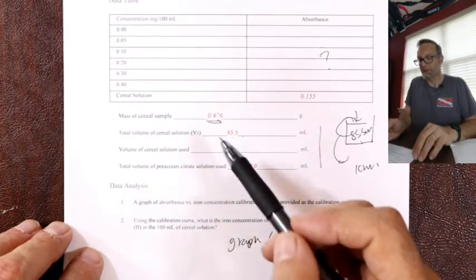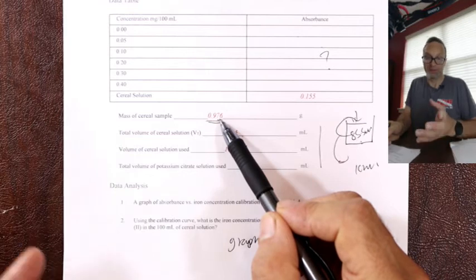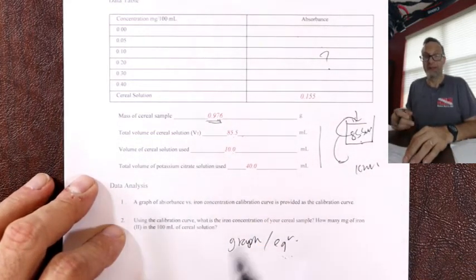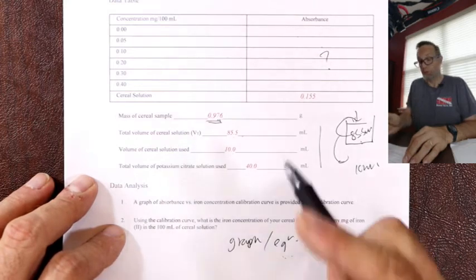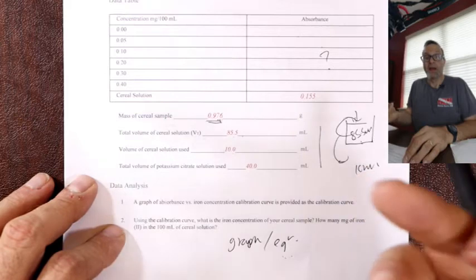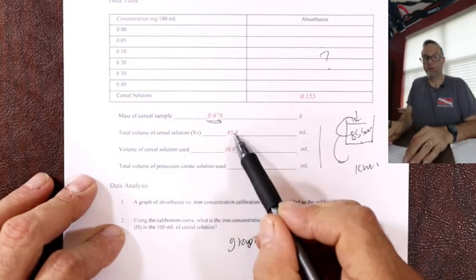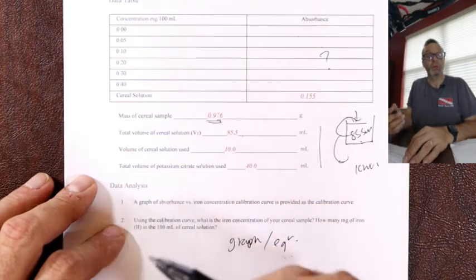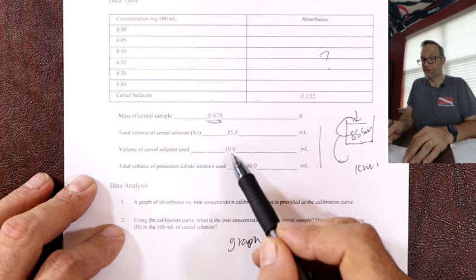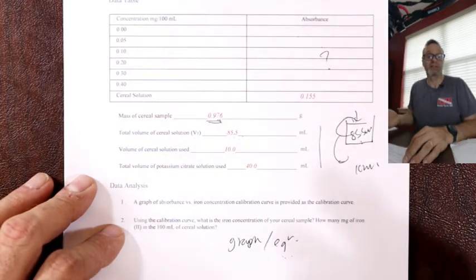You collect around 1 gram of ground up cereal from the cereal box. You digest that, and you can read the procedure to turn the iron in the 1 gram approximately, and don't use 1 gram, use the actual number. So that iron is leached out, it comes out into solution, and you drain that solution and you measure its volume. All the iron from the cereal's 1 gram is in this. Then you take 10 milliliters of this and take it away for analysis.